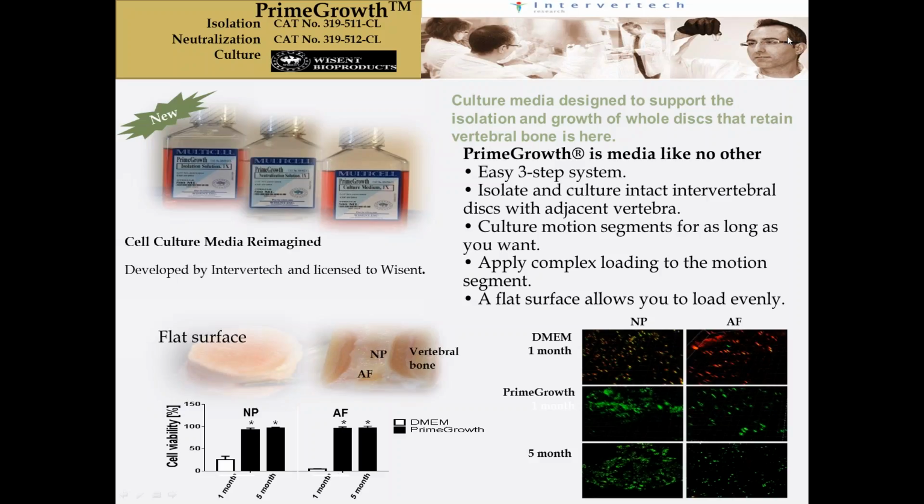This is very important. We've been talking about applying loads, complex loads. You can't apply a complex load without a flat surface, and that flat surface has to come from vertebrae. You can make a flat surface with soft tissues, but you can't apply complex load on that. Ben has been doing a wonderful job of applying complex loads, and also Christine. So one of the things that is important is this flat surface. Otherwise, you have uneven loading of the disc.